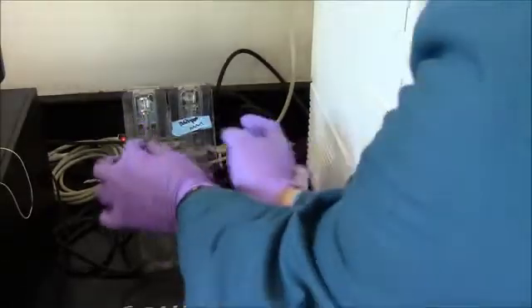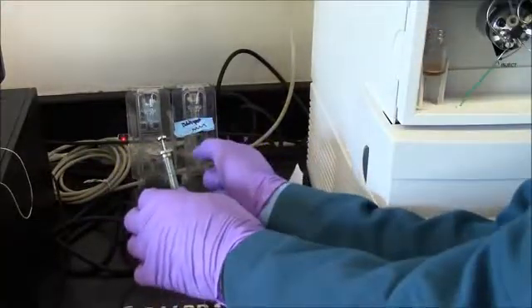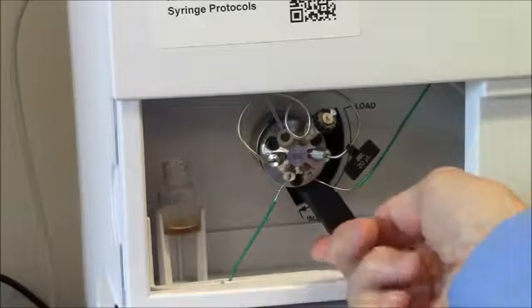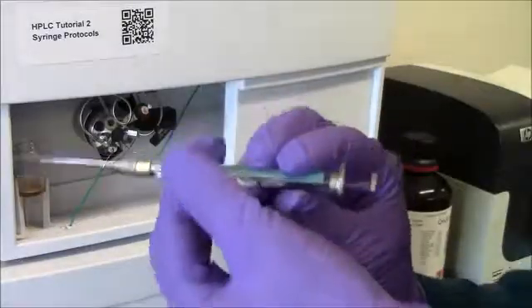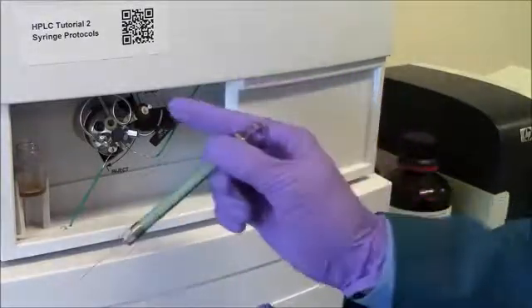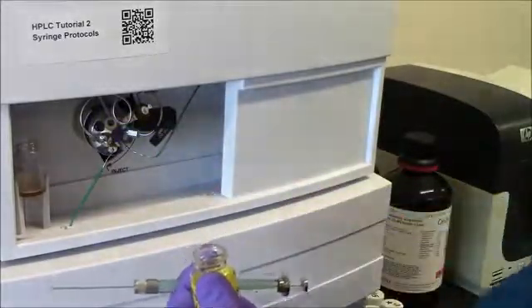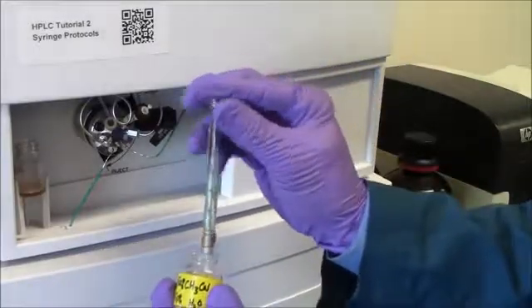This side actually holds the syringe fairly well. This side doesn't. That's why there's a piece of tape here. You'll notice there's a lever here that has 2 positions, inject and load. At this point I want it on load. This is a 50 microliter syringe, and I'll do what's called flushing the loop here. There's a loop here in which the sample that I want to run will be held ready for it to be delivered to the column.